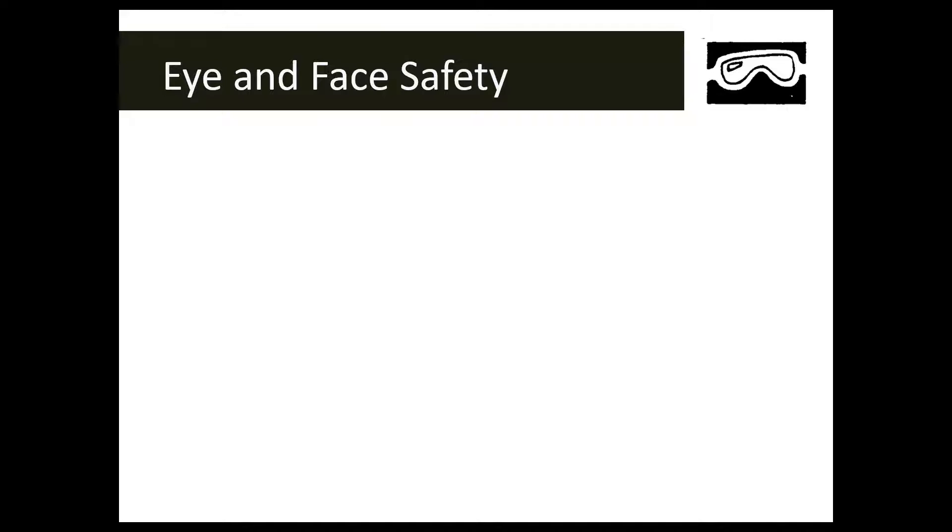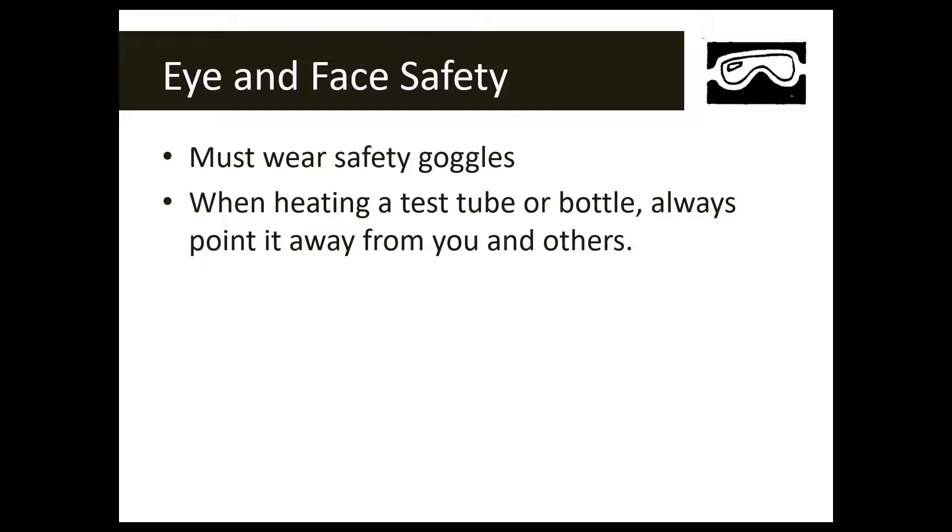Make sure you know the location of the shower and eyewash station. The eye/face safety symbol is usually a picture of safety goggles or safety glasses, and when you see it, it means you must wear those goggles. You'll see this symbol paired with the glassware safety symbol, the chemical safety symbol, and often with fire and heat safety. If you're heating a test tube, even while wearing safety goggles, make sure you point it away from yourself and others.